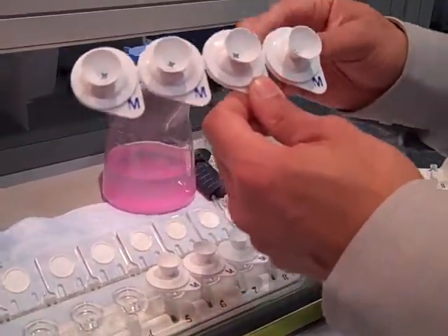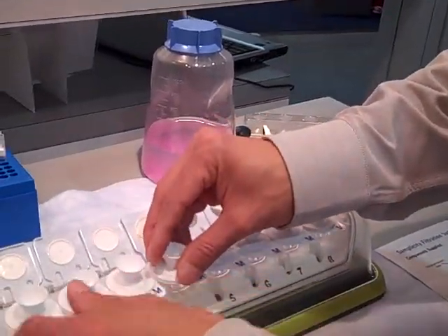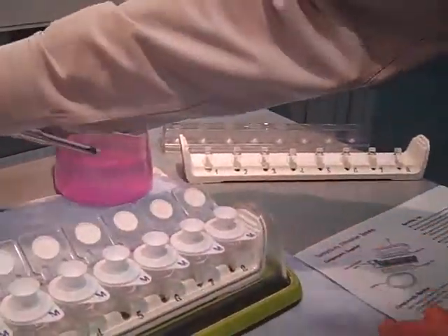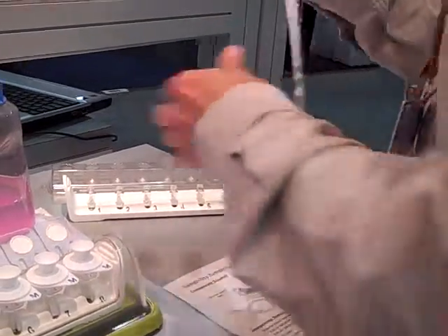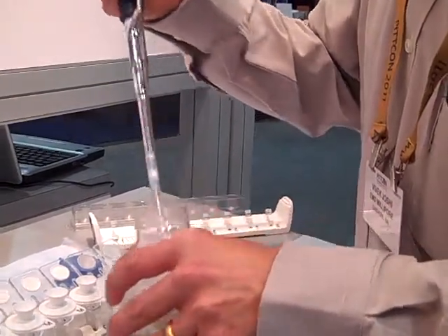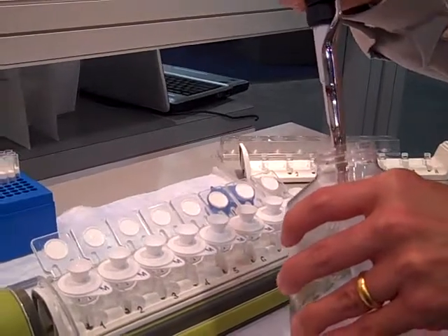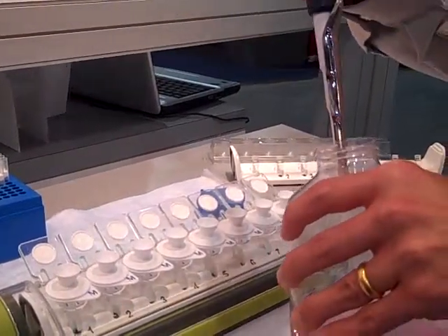The system allows filtering anywhere from 1 to 8 samples at a time. The filters come in strips of 8, which are perforated, so you can tear apart individual filters depending on how many samples you need to filter. After the vials and filters are set up, the sample is added to the unique conical-shaped filter funnel, which holds up to 2ml of sample — the maximum capacity of HPLC vials.